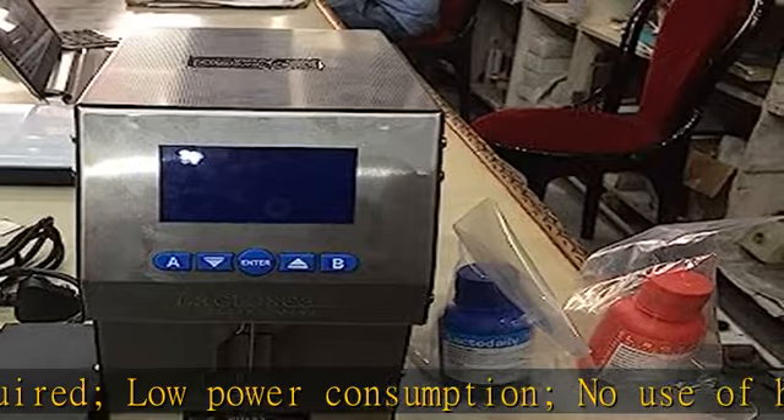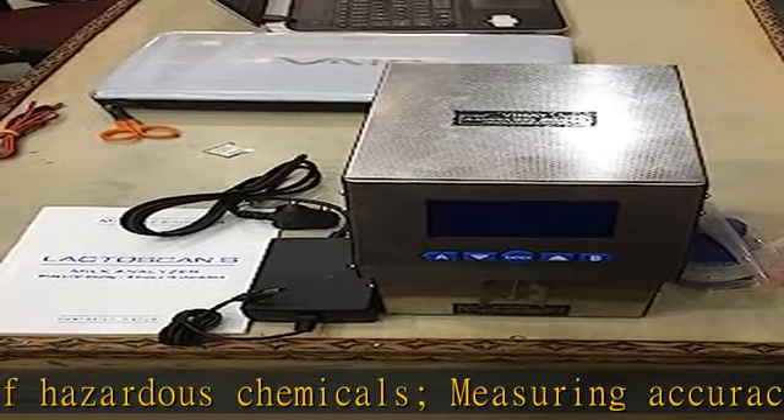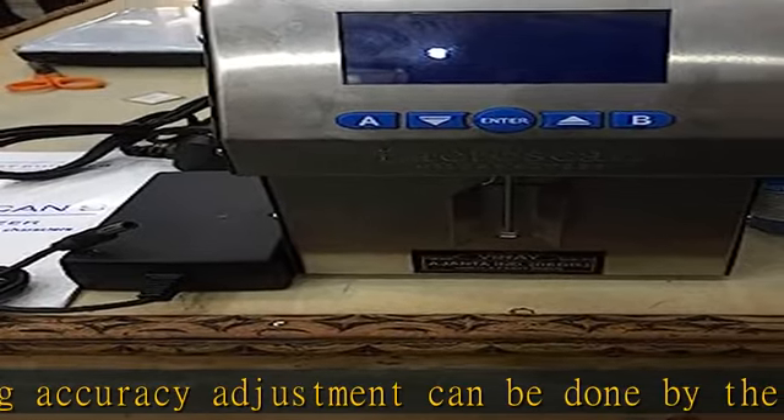USB, USB flash drive. Embedded printer. Embedded keypad. Works on 220V. Check the description to get this product today at the best price.